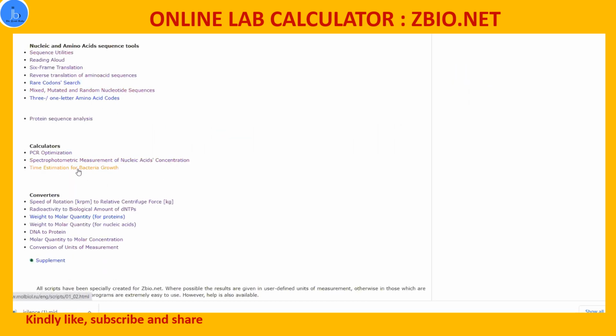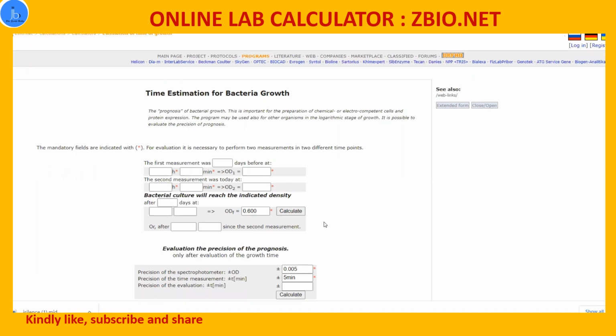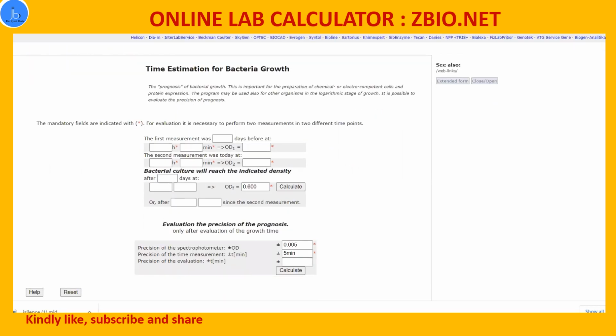Similarly, if you are handling microbial things and bacteria, you have to calculate the time for calculations about the growth related experimentation. So you can do these tasks, especially if you are from microbiology and biochemistry, and if you have to perform tasks related to protein purification. Based on your bacterial culture OD, you can do these tasks to get ideas about the bacterial growth. You just have to plot the values here and you can calculate easily.